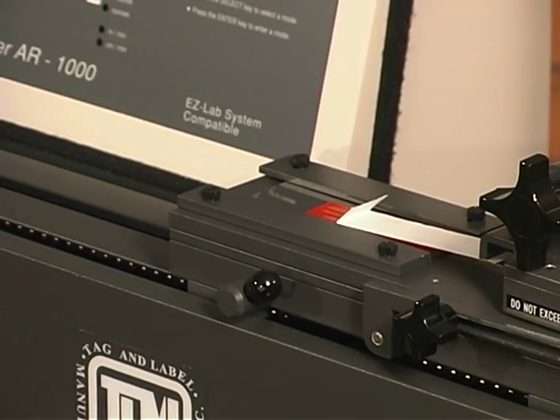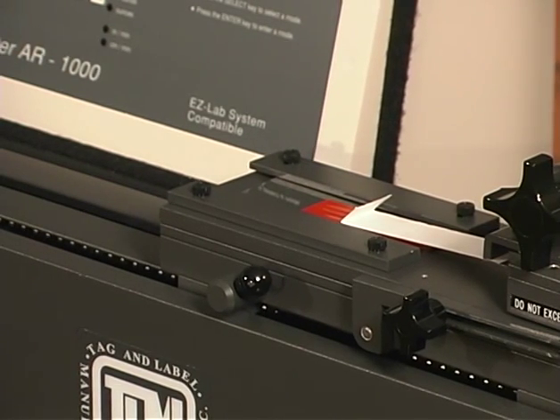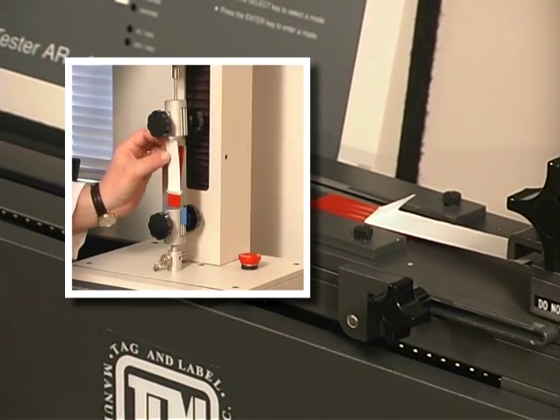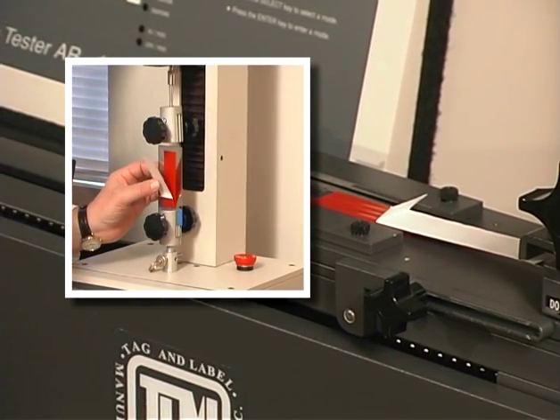This test is being performed on the AR1000 adhesion release tester from Chem Instruments Incorporated. A tensile tester may also be used with the appropriate clamps or peel adapter.